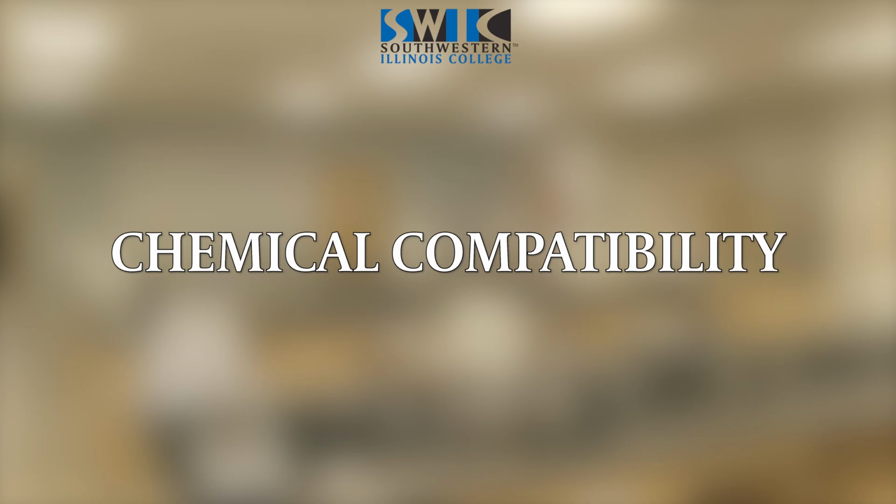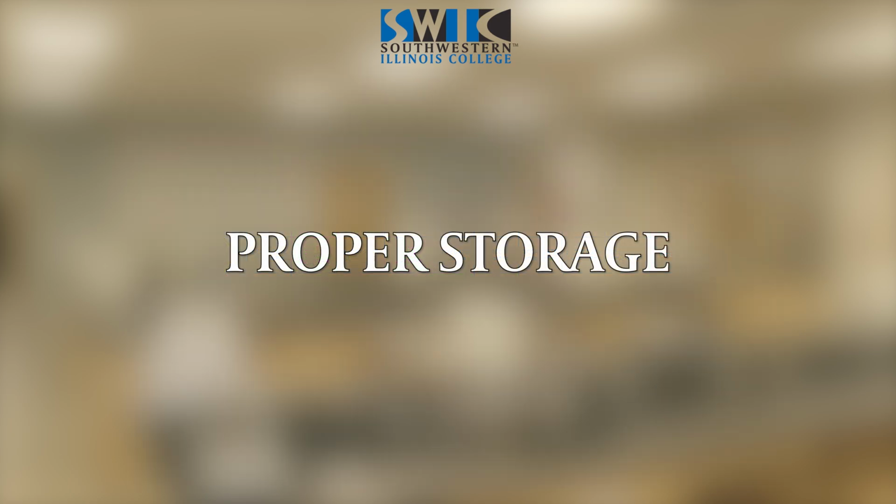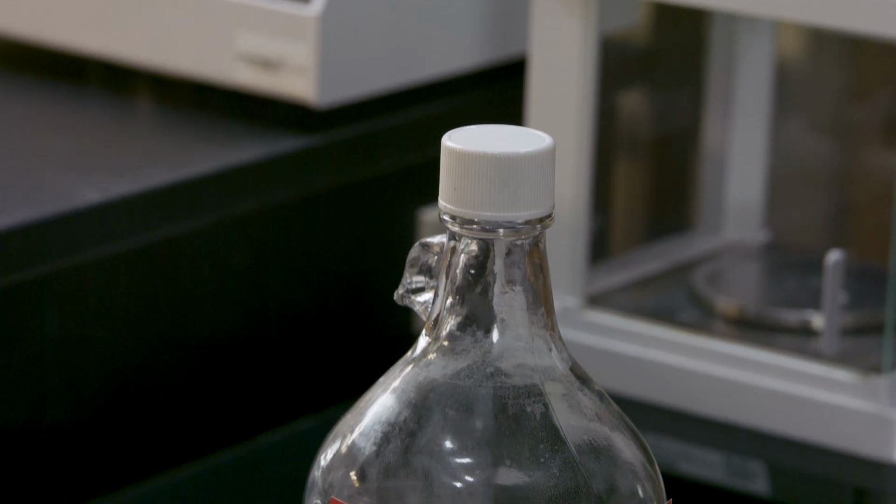Be aware of chemical compatibility. Some chemicals can react violently when combined. Always refer to compatibility charts and guidelines. Store hazardous waste in designated areas, away from regular lab activities. Use approved containers that are chemically resistant and leak-proof.